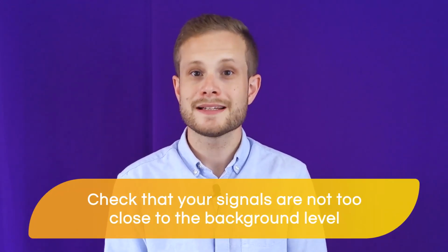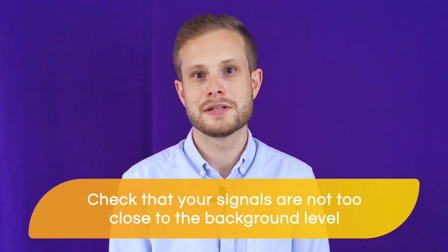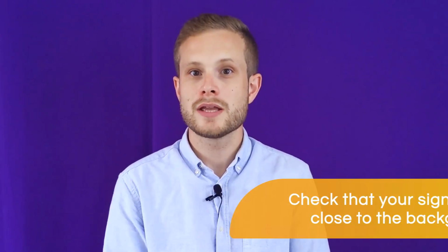If you are satisfied that you don't have any signal saturation in your image, the next thing that you should check is that you don't have the opposite problem, and that is too little signal in comparison to the background. This is where you should check the signal-to-noise ratio, or SNR, of your bands. Once you have quantified the bands using the appropriate tools in your software, you should determine the signal-to-noise ratio for each one in turn. This is calculated automatically in Empiria Studio, but you may have to work it out yourself with other software programs.